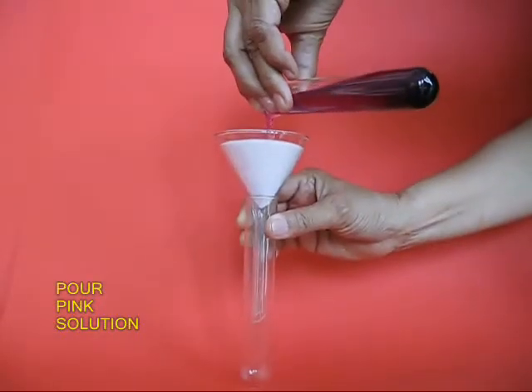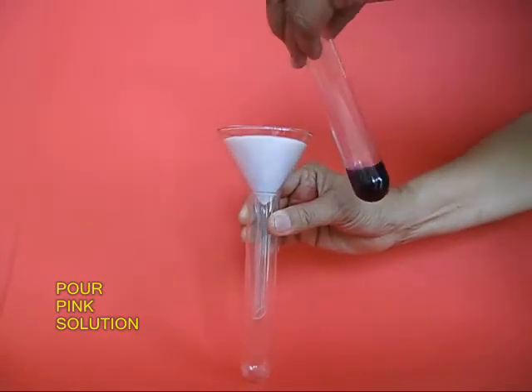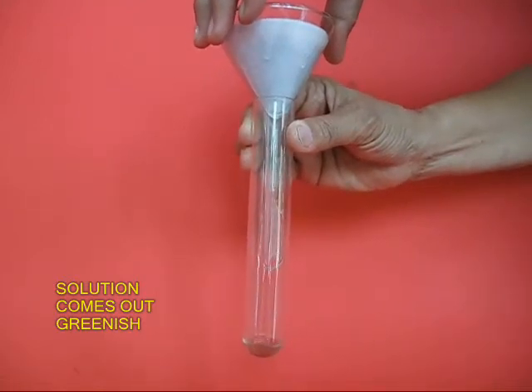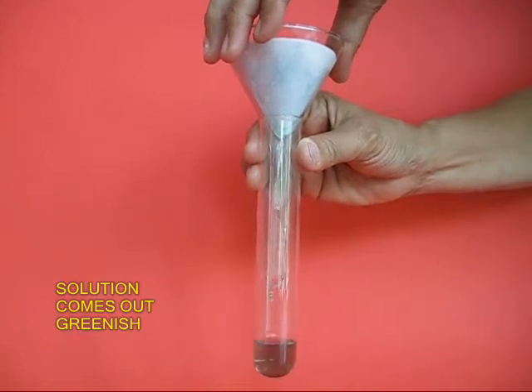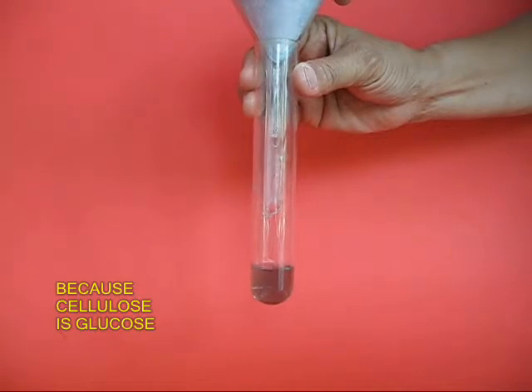Now pour the pink solution onto the filter paper. After some time, a solution will emerge below, and surprisingly the solution which comes out is not pinkish in color but greenish.